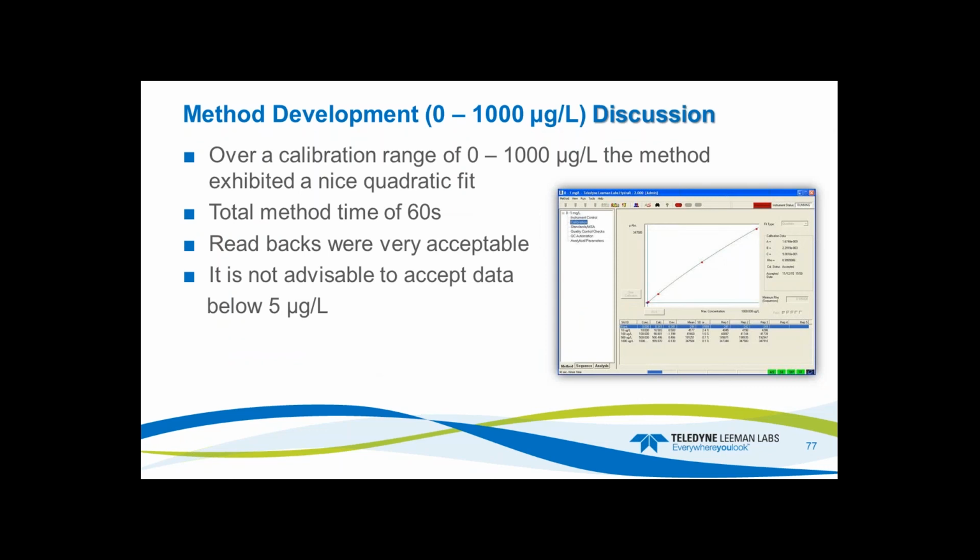My total method time was only 60 seconds. That is really, really fast. That is a speedy method for this type of calibration and the concentrations I'm using. Readbacks are very acceptable. It's not advisable to accept data below 1 or below 5 ppb.